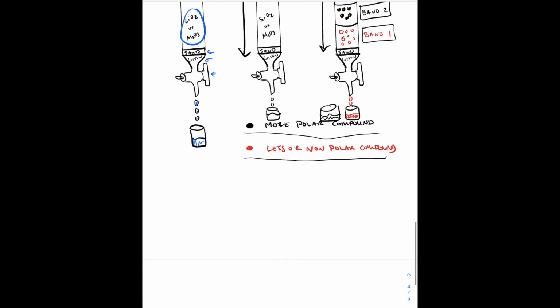And before you actually do all the work that it takes to prep column chromatography, what you typically do is a TLC plate, because since they're so similar, you basically try it very quickly on a TLC plate, because it takes a small fraction of the time to run a TLC than it does to run an actual column.